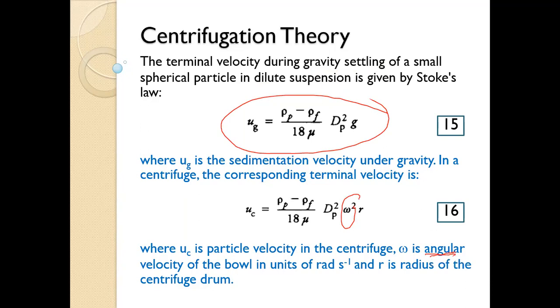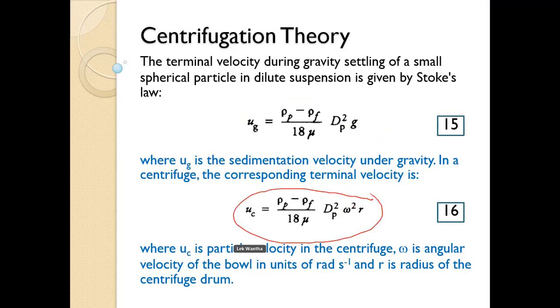But mostly we compare G and omega. For the centrifuge, the omega is very high compared to G. For the centrifuge, we apply this equation.